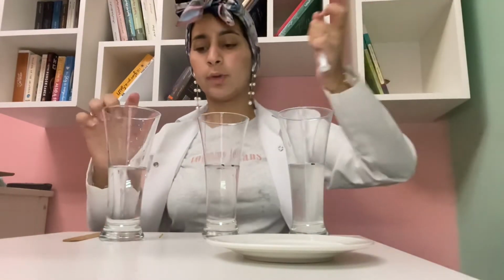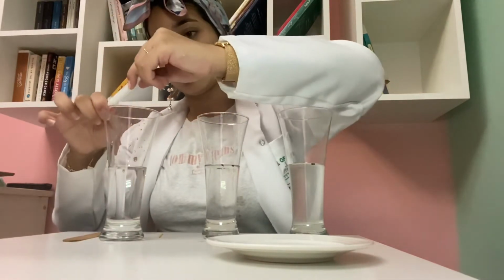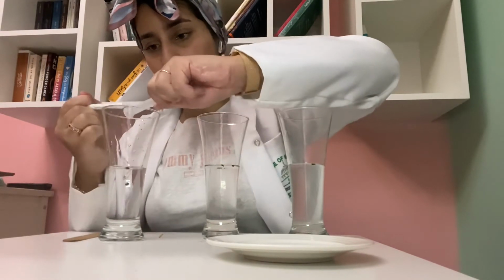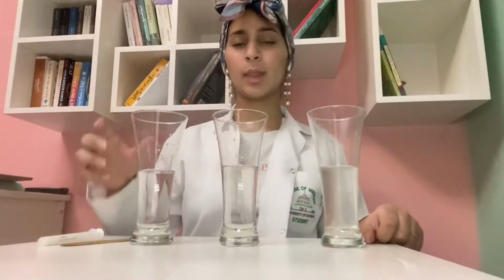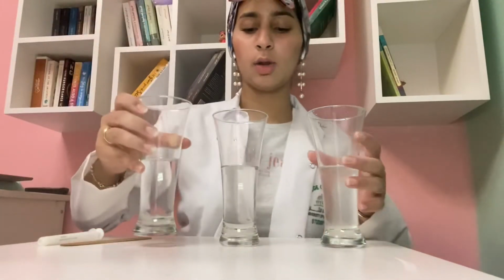So we're going to fill it back into the container again, and we're going to repeat the process for both of the rest of the containers. Now, as we can see, they're sinking down. Now I have my discs sinking down in all of the 3 containers.